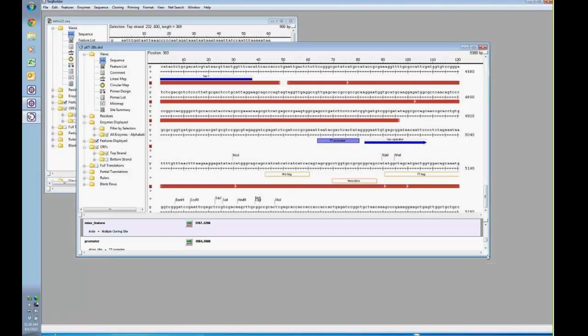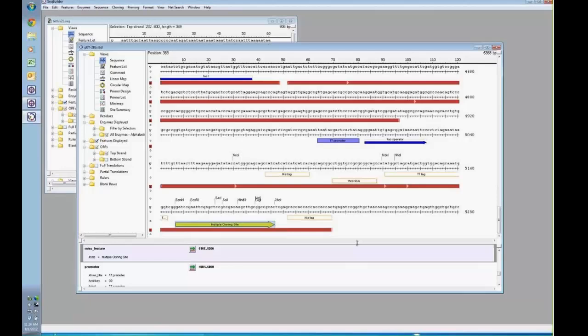While you're transitioning there, we have a couple questions that have come in. One is about predicting ORFs. Can you predict open reading frames for Sanger sequencing data in SeqBuilder, or how would you do that? Sure, definitely. One thing I'd like to clarify here is this is just normal sequence data. So this is from a FASTA file, this is from a GenBank file that was pulled down from Entrez.